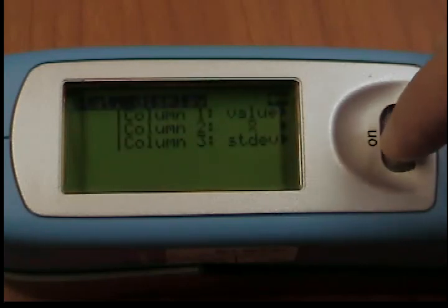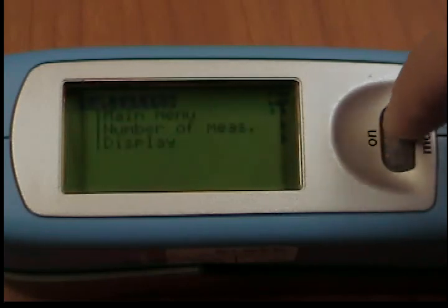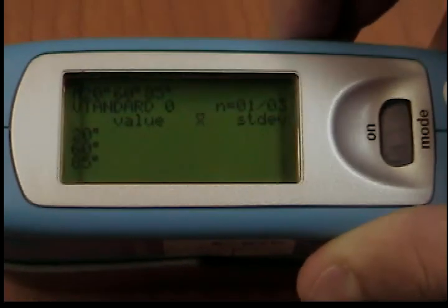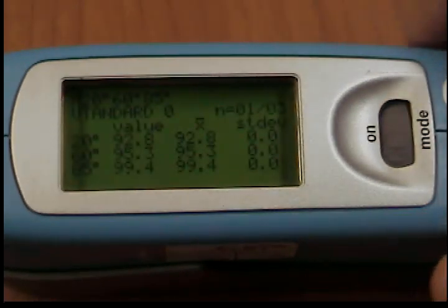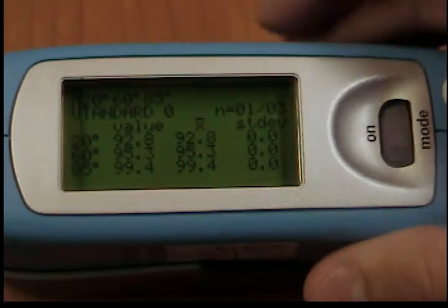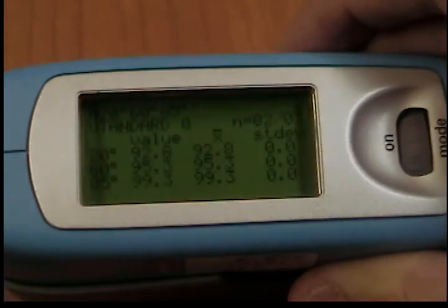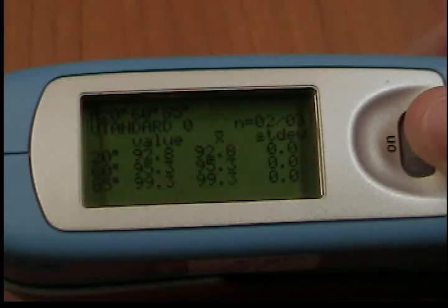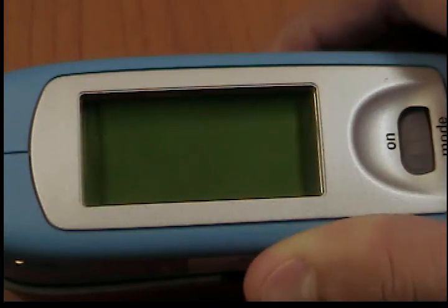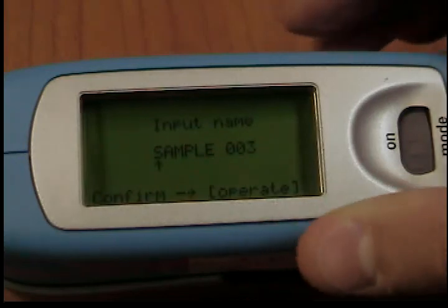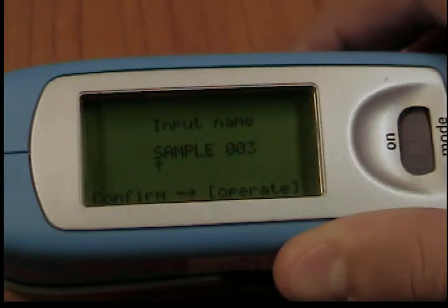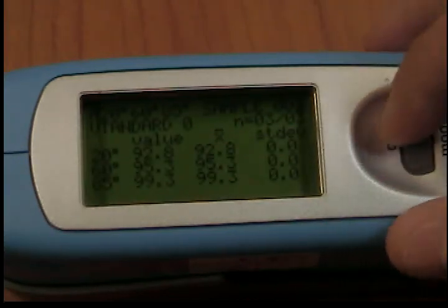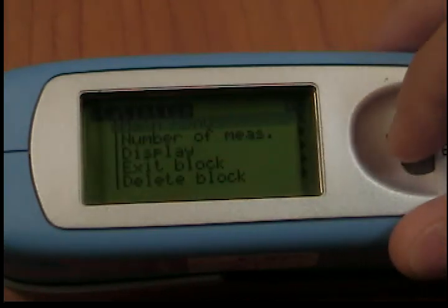Exit block: This function terminates the block before it reaches the required number of measurements, n. It is useful if you have selected a high number of measurements for n, for example in the case of large samples. If Save is turned on, a display appears to enter a block name for the sample. Delete block: This function deletes the current block. Delete measurement: This function deletes the last measurement value.